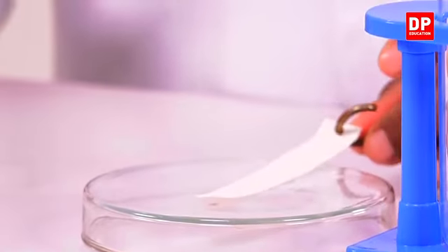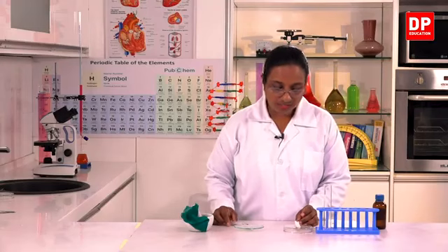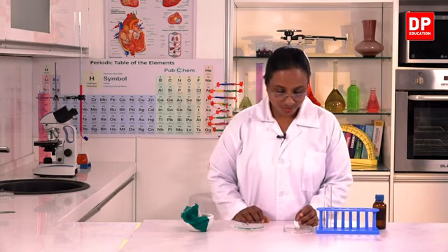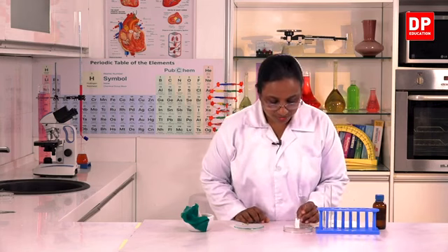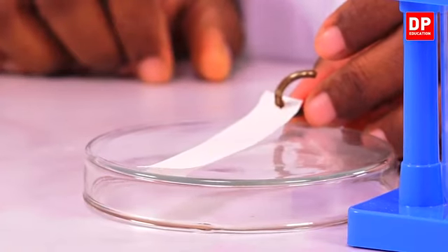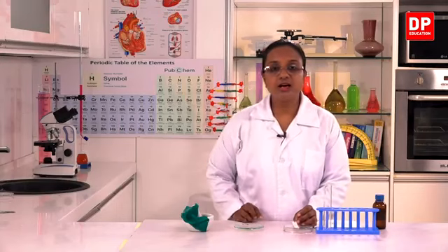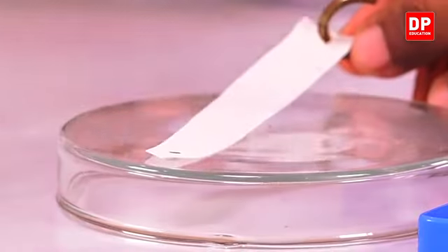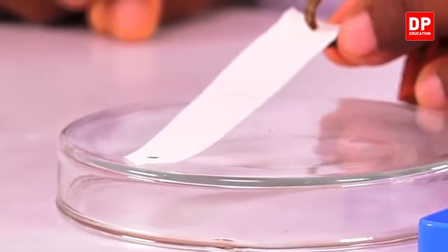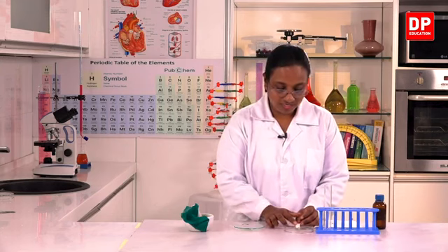So here you can see it's a very small drop. It would be better if you can make a tinier drop using a capillary tube, and we have to allow it to dry for some time. So here it's already dried. If there isn't enough sample there, then we can put another drop, but here the sample is sufficient. So now I have to get this into the chromatography setup.